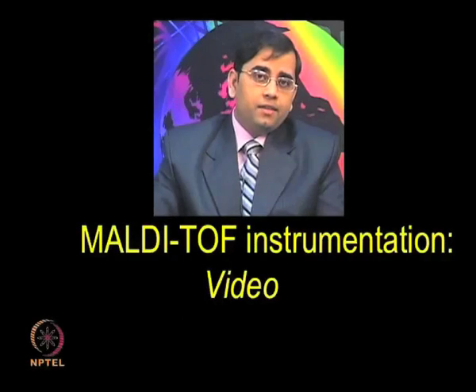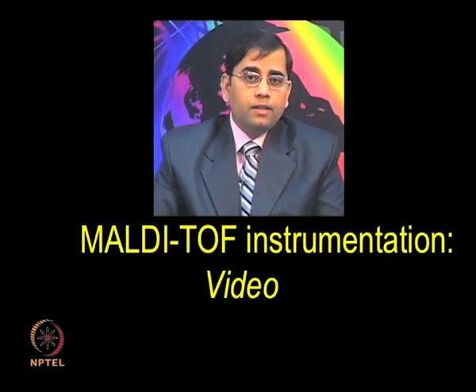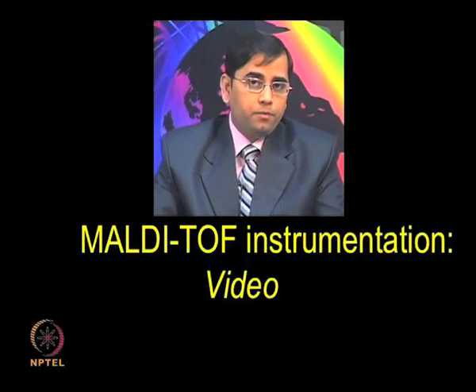After spotting is done and the MALDI plate is dried for almost 30 minutes, the instrument can be turned on and MS analysis can be performed.